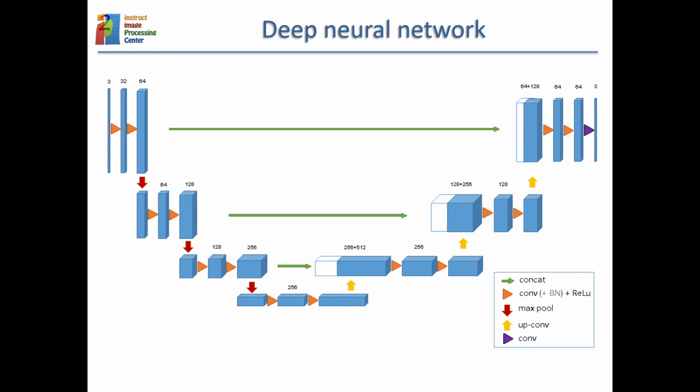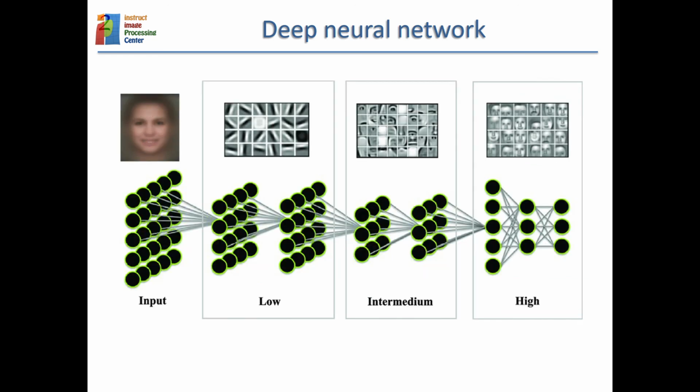And regression is just learning a function that you want, and in our domain, learning a function can be aligning 2 images. So given 2 images, tell me the angle between those 2 images, or given an image, tell me what is the denoised version of that image, or give me the enhanced, so the sharpened version, and you can be really creative there.